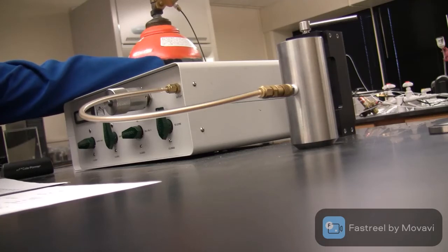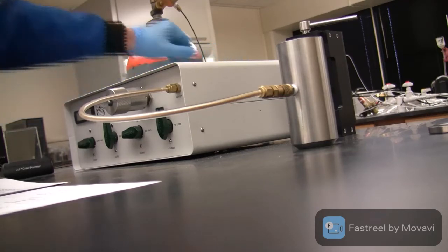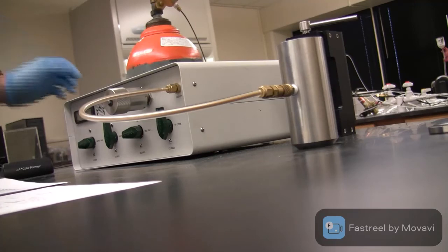So now I am at 85, and close, okay, 93, and 95. Okay, it should be between 94 and 95. Now it is 95.01.